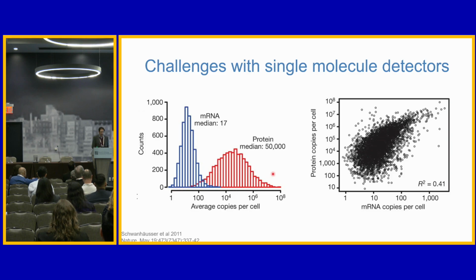Right? Every time you read one of these, you will have to have plowed through all of this stuff to have been able to see that low abundant thing. Now, we can use antibody binding reactions as a way to do enrichment for those particular types of signals. But remember, at any given time point, an affinity-based reaction only gets you a couple orders of magnitude of improvement in dynamic range, right?